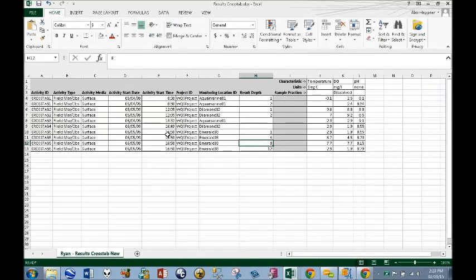So I know that lab or organization result exports come in all shapes and sizes, and this is what we call a cross-tab format, where you have the header row that distinguishes the characteristic name and the units, but still has all the activity level elements in the regular columns. But let's take it a step further. We can even map data that just looks like this. Temp, degree. So as long as I just have the required, let me see, DO, milligrams per liter, and this is pH. Oh, that's not OH, that's pH.